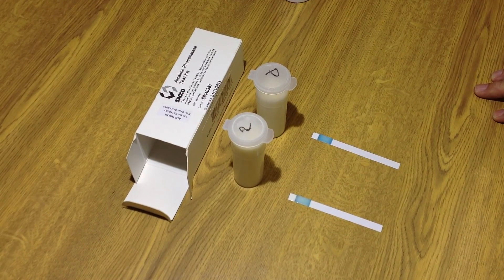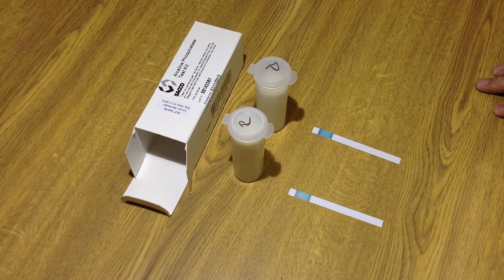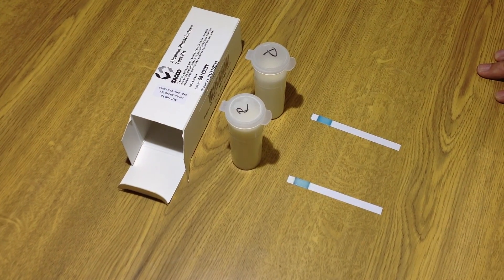Hopefully we should have a blue remaining on the pasteurized. And if there's any phosphatase enzyme left in the raw milk, we should get a green result there. So five minutes, room temperature.